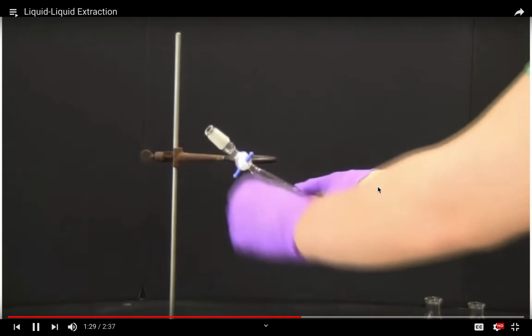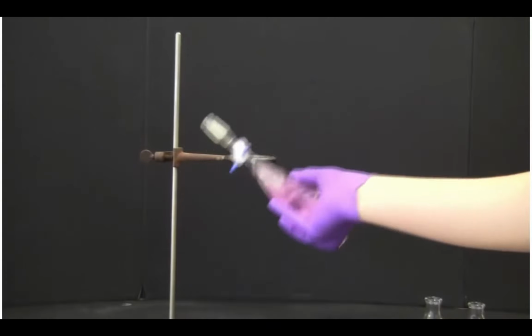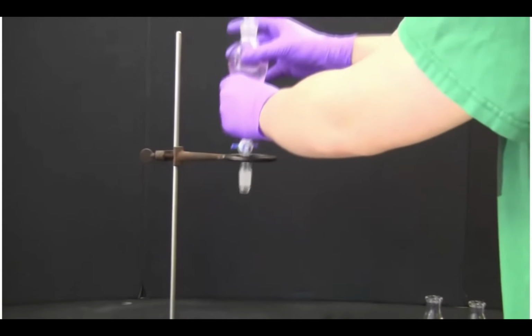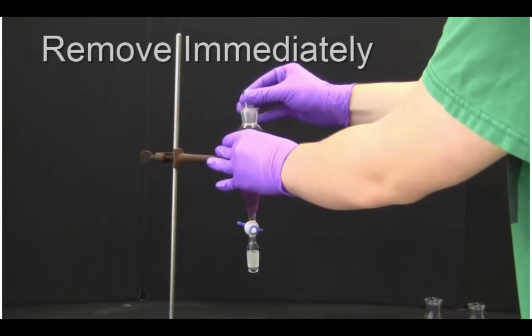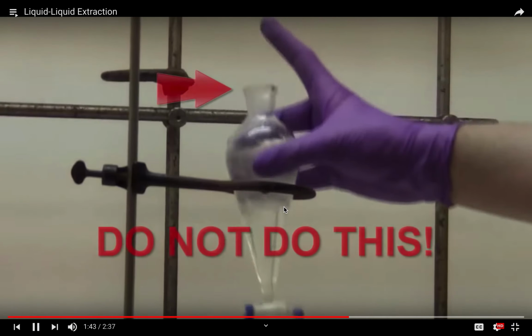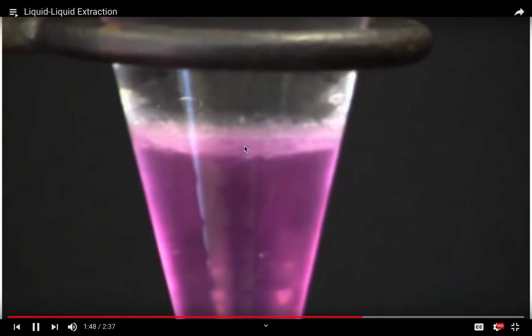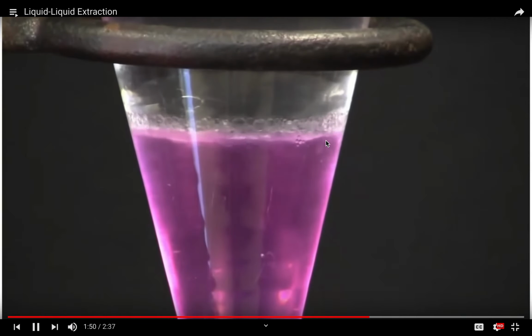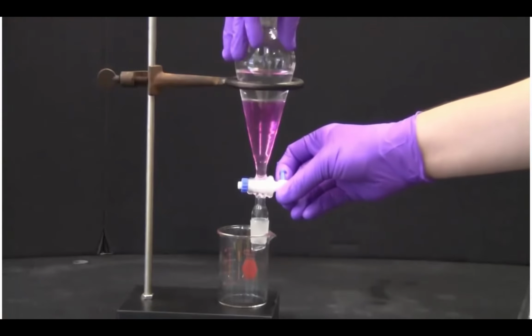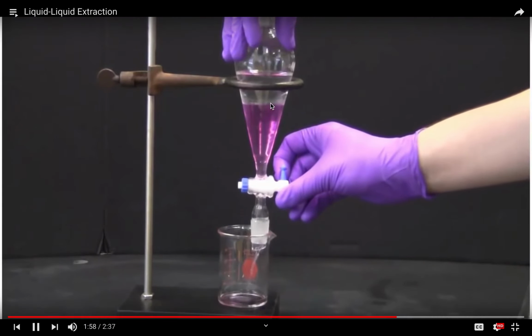The mixing is like swirling the flask gently, but make sure the layers mix with each other nicely. Remove the cap immediately when you're done and wait for separation of the layers. Here, the separation of the layers is getting much clearer. So you can start your separation when it's a nice line.